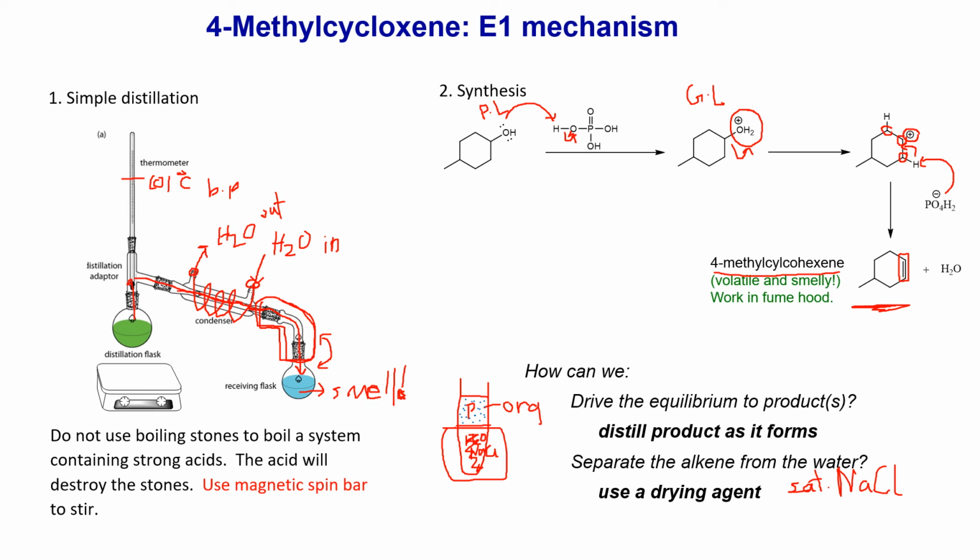Well, you can add in anhydrous sodium sulfate. So if you add in, you add this to the top layer, anhydrous, I'll put a short form here, anhydrous sodium sulfate, right? So anhydrous sodium sulfate will take away the water to make this top solution, this organic layer, completely dry.